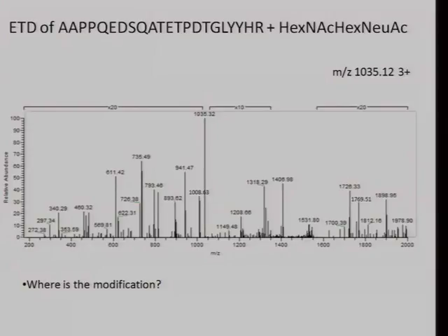You can also, I have an Excel table on my computer that I just pull up and it has masses in one column and compositions in the other. So I have my own cheat sheet that I can go through and say, whenever I see this mass, what composition could it correspond to? We were doing it from first principles here to try and explain how we're actually getting there. But you can have the answers in the back of the book and look them up.